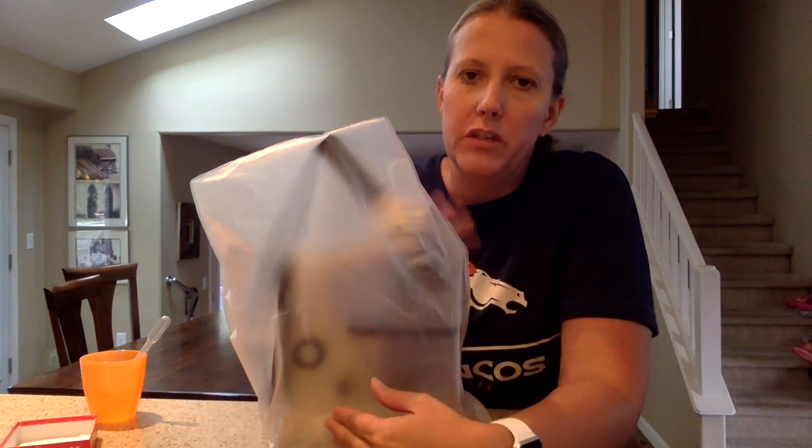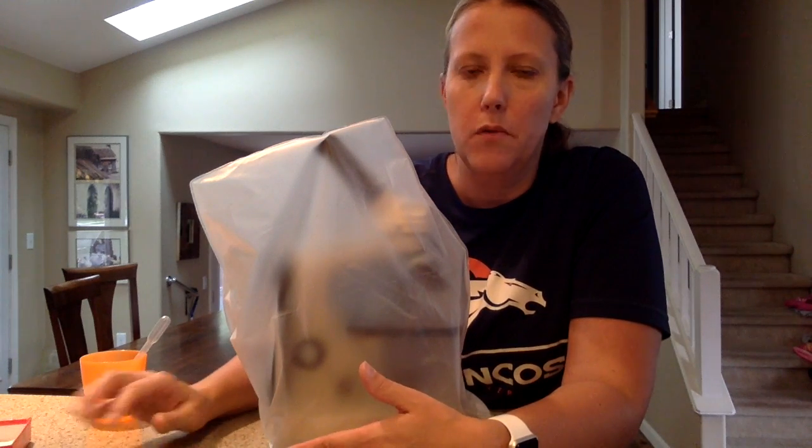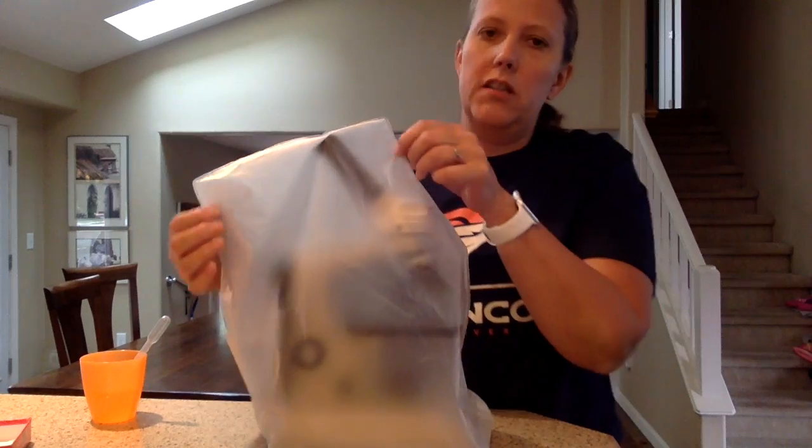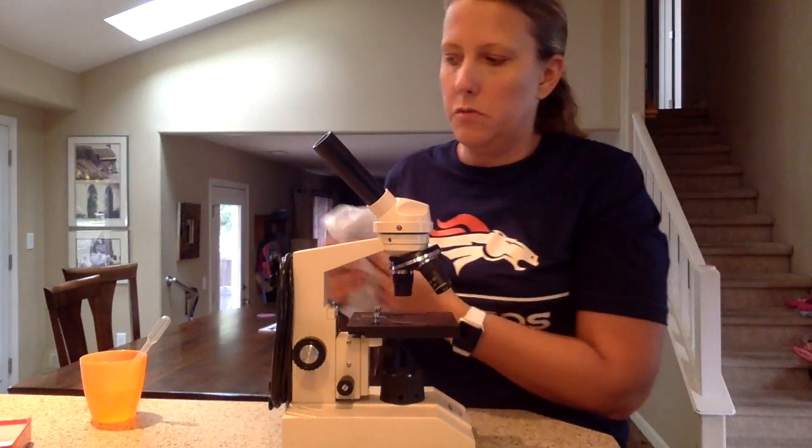When you get your microscope, it should always be covered. That protects the lenses because dust buildup on the lenses can actually damage them over time. So you'll take your dust cover off and put it in a safe place because you'll need to put it on when you're done.